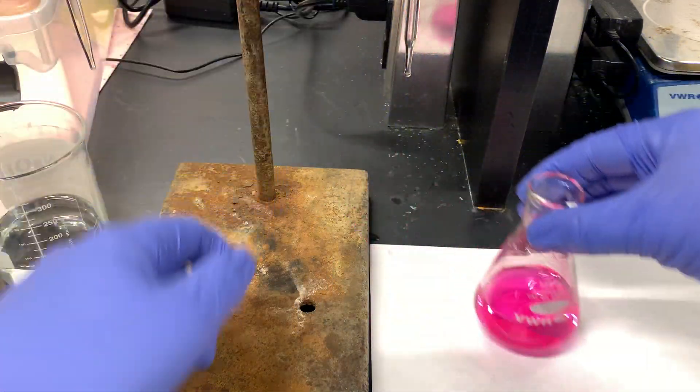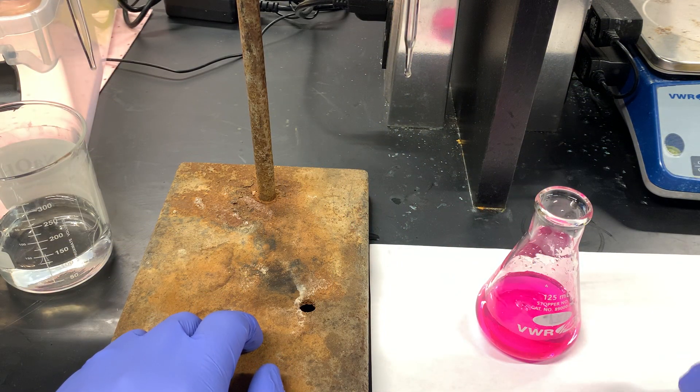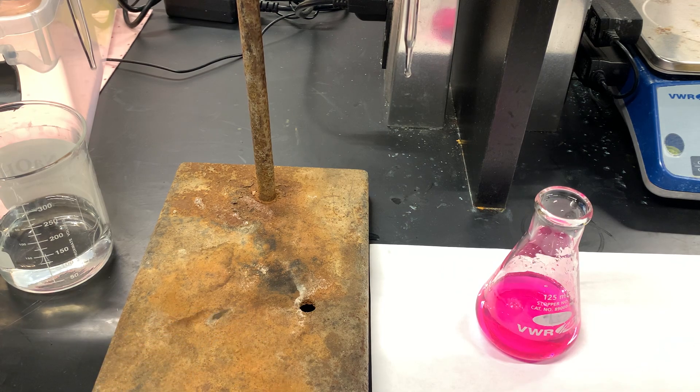And that looks like... there we go. Already done. The volume that it took is not so substantial. And I can see that my solution has already changed colors.